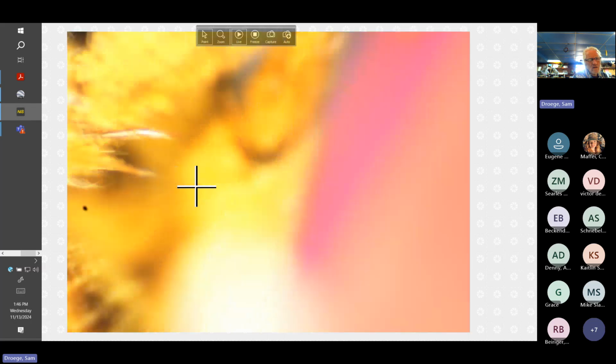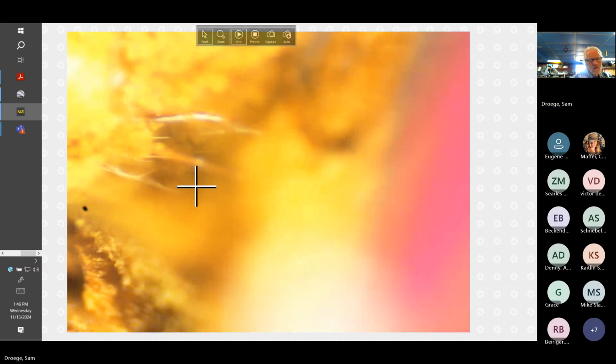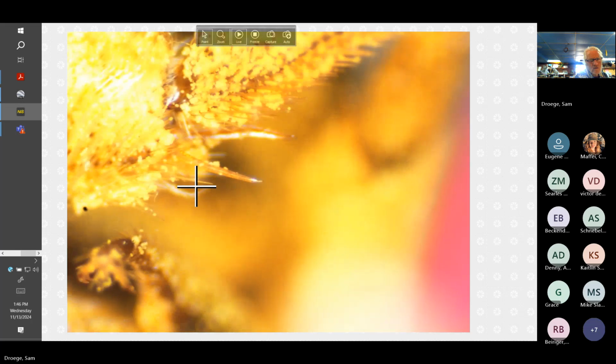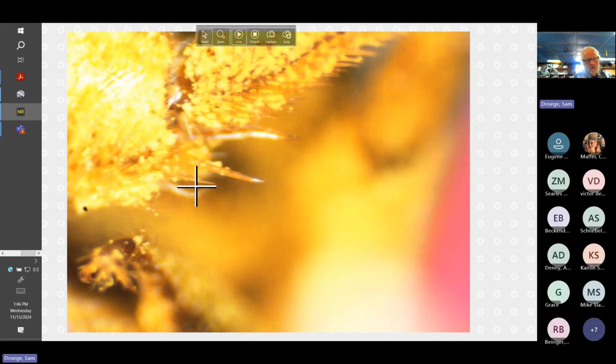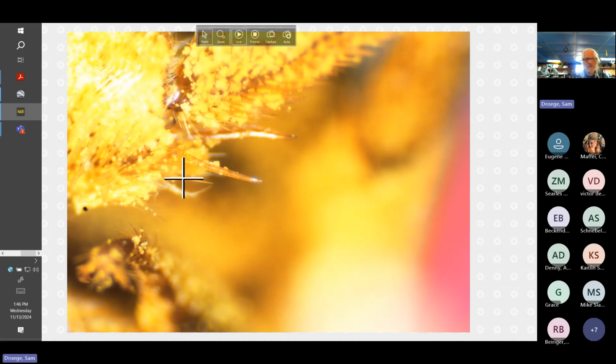And we have two spurs. So it's a little confusing, but here is this almost always normal outer spur. So this is the outside face, which makes sense because there's all the pollen in there. Who knows what that is? 100-year-old pollen.